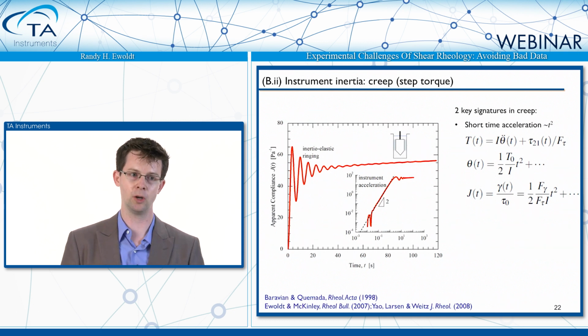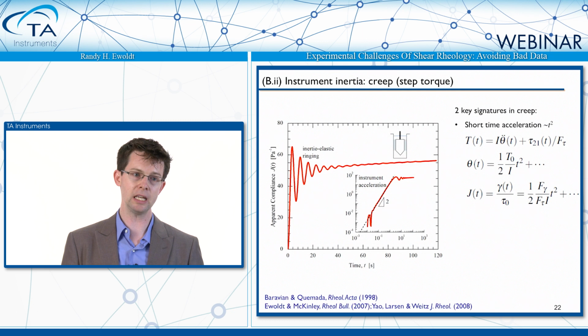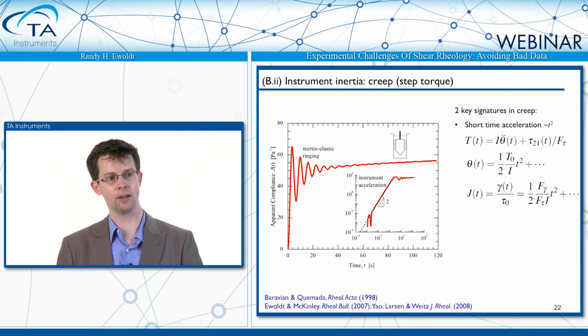The equation that I'm showing with the dot, dot, dot just looks at the very first term that you'd expect to see, independent of what the material is. This is true even if the material is a rigid, very stiff material. The first thing you'll see is something has to get up and get accelerating. Of course, you don't see that very much if you have a very stiff material because you see the material resistance very quickly. For this soft material, or especially water-based materials, it's very easy to see that acceleration stretching over very long times.